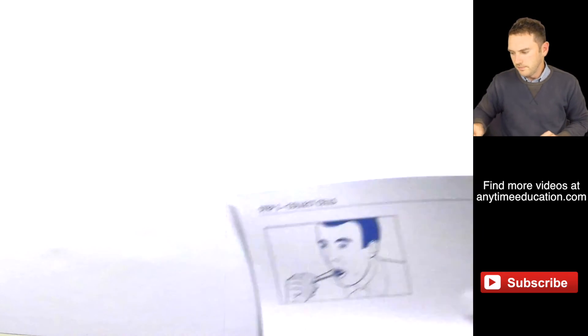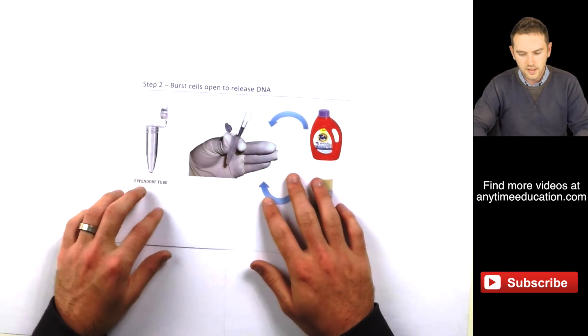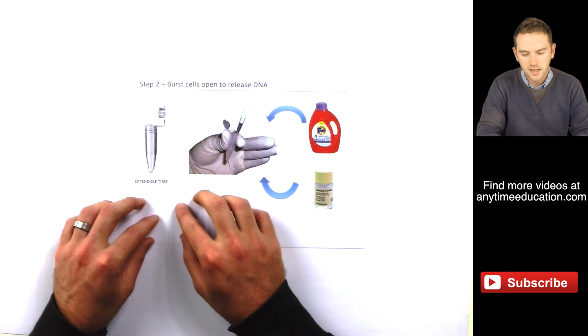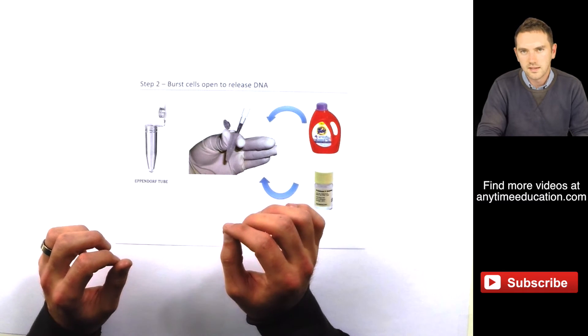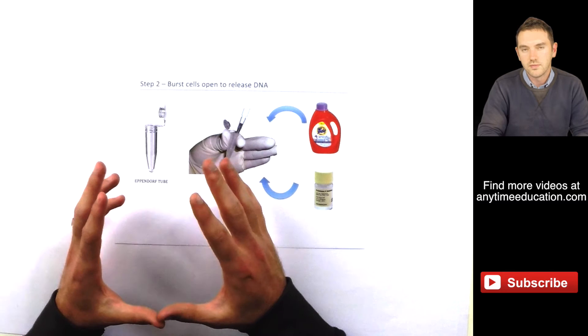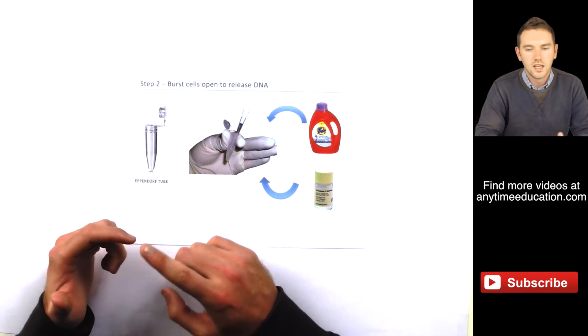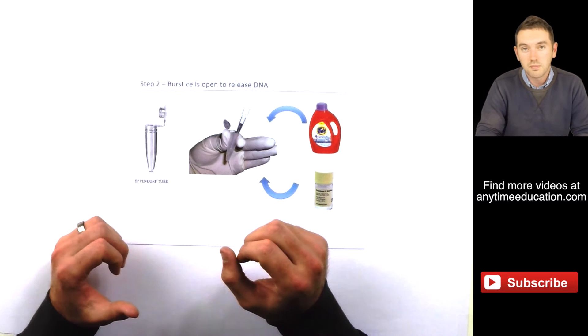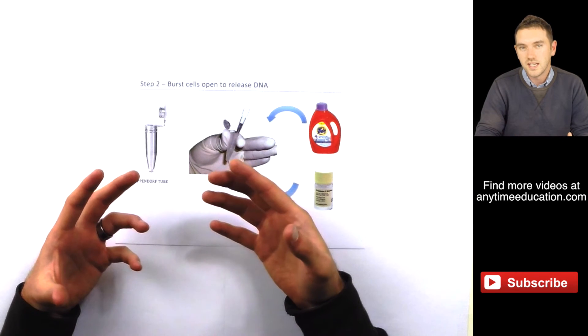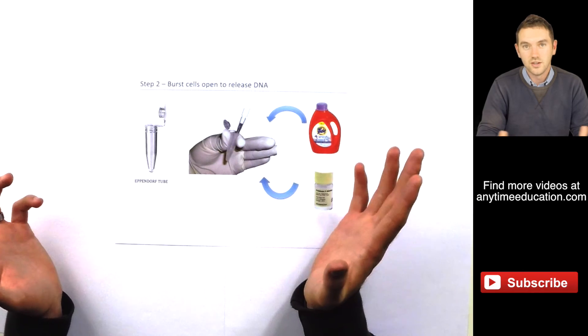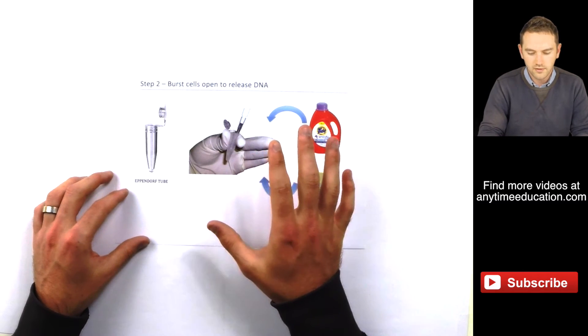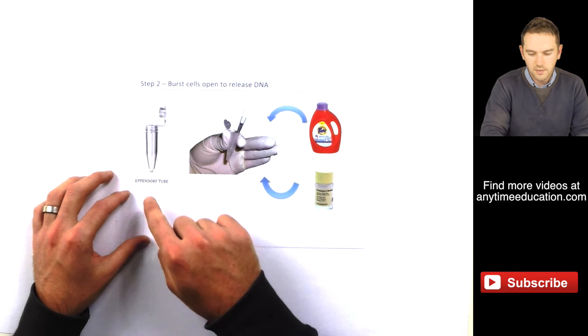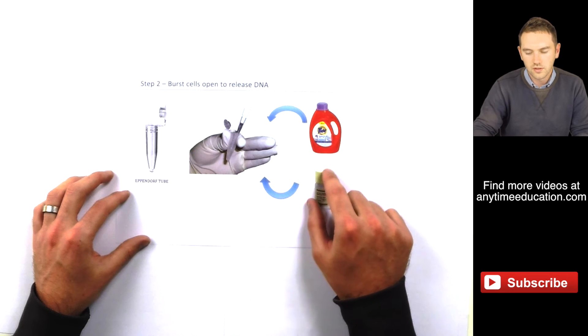We're then going to take our buccal swab. And we're going to place it inside an Eppendorf tube. So we're going to just cut off the end. And we're going to put it in our Eppendorf tube. Now it's very important as we deal with DNA that we don't contaminate the DNA. Because that's going to reduce the validity of the information that we get. For say our crime scene. Maybe we're mixing victim and the perpetrator's blood. Or what would be even worse as a scientist if you put a bit of your own DNA in with victim's blood. And then suddenly you're a suspect. We wouldn't want that. So very carefully we don't want to mix any DNA. So we place our cotton swab inside the Eppendorf tube.